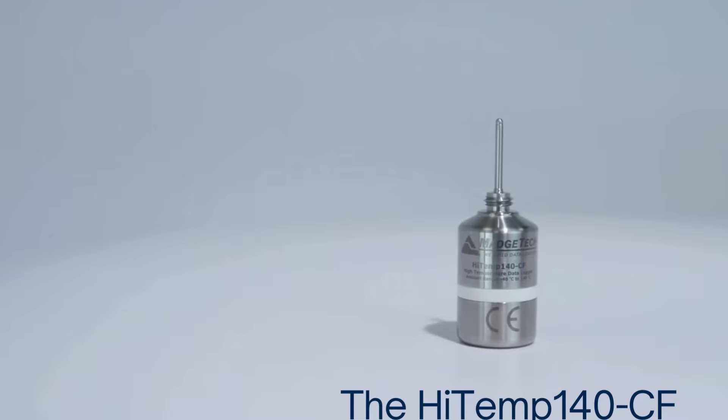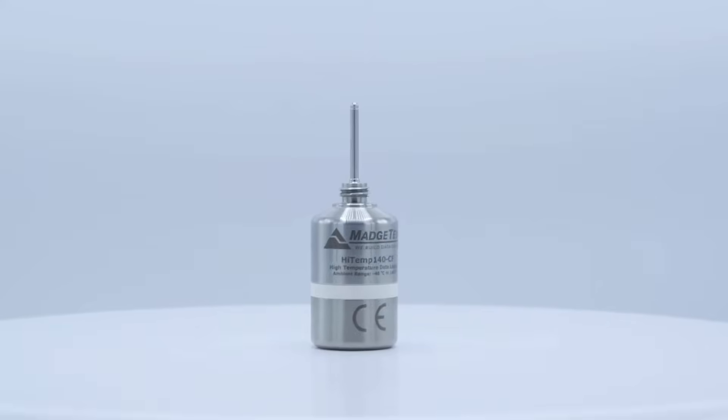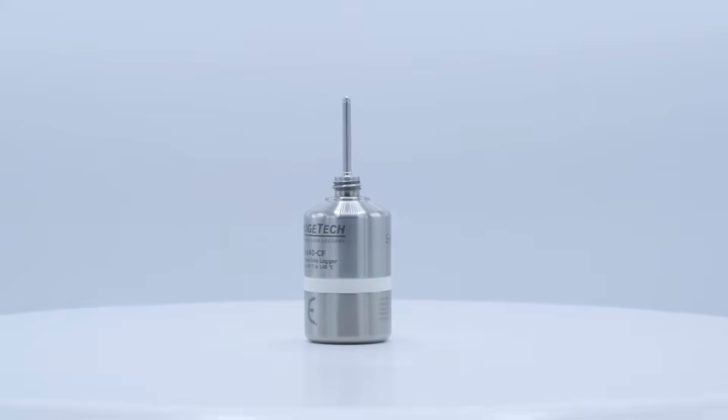Introducing the HITEMP 140-CF from MAJTEC, engineered for precision and resilience in diverse food processing environments.